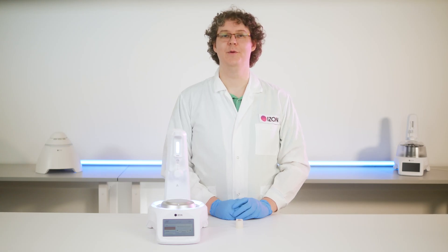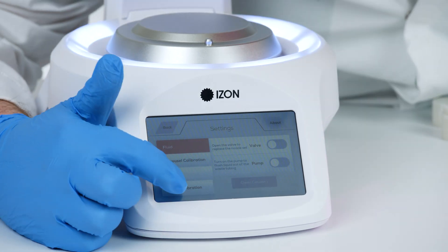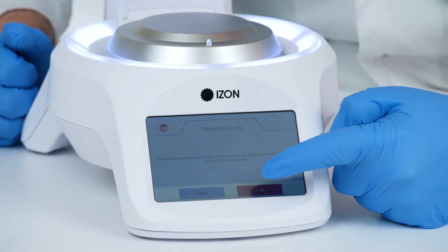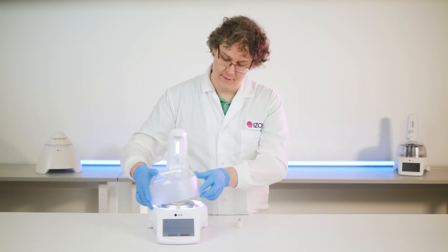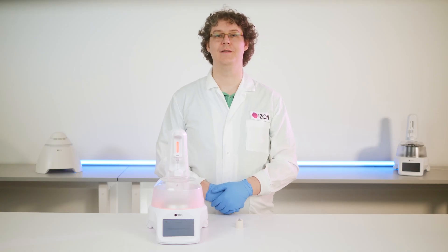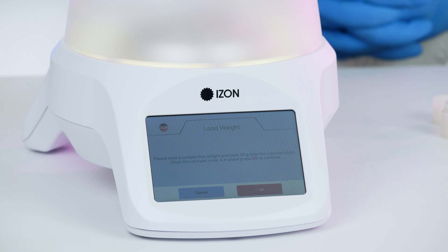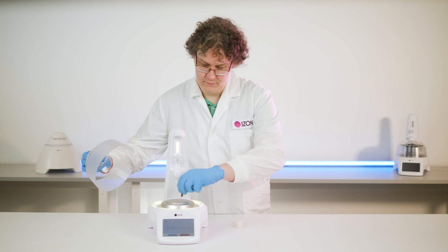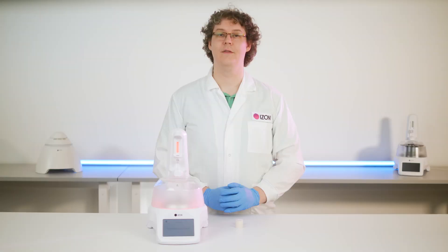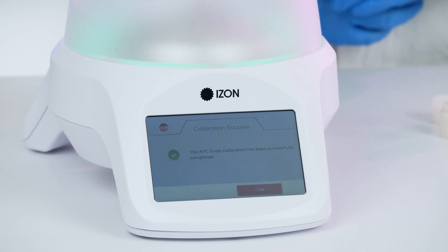To calibrate the scale you will need the 10 gram weight supplied with the AFC. Select Settings, then Scale Calibration, then press the Start Calibration button. Remove the carousel and place the carousel cover on the AFC, then press OK. The AFC will turn red as it internally calibrates. The lighting will turn yellow to prompt you to place the 10 gram weight on the scale. Replace the cover and press OK. The lighting will turn red again as the AFC calibrates, then turn green when the calibration has completed.